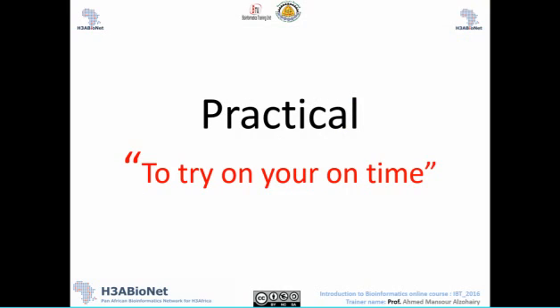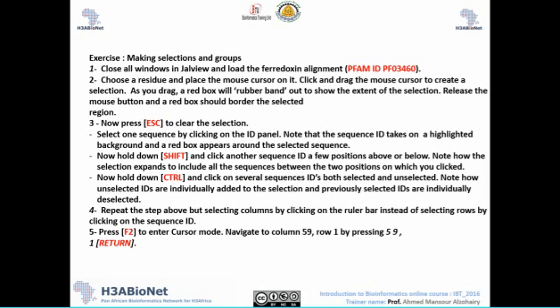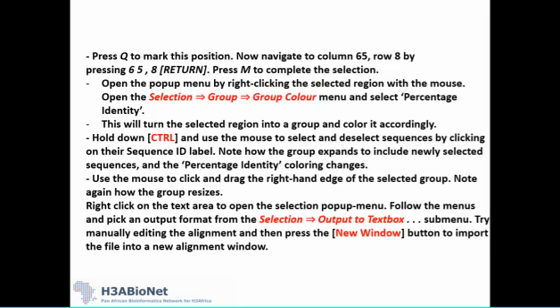Anyway, this is the last lecture. Jalview can give you lots of possibilities for analysis of multiple sequence alignment. The good thing about Jalview is that you can use it with other programs.